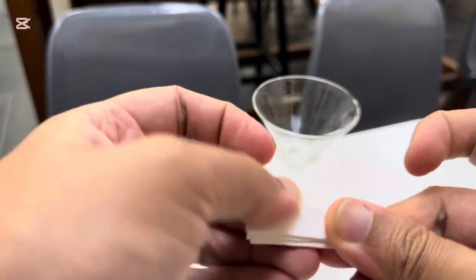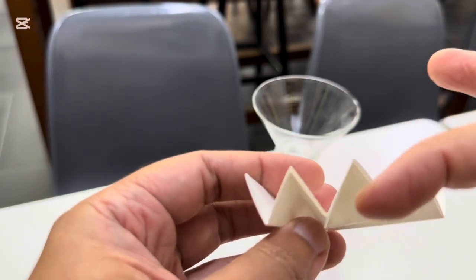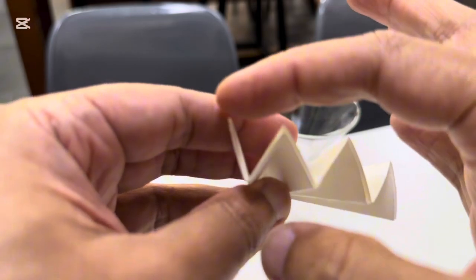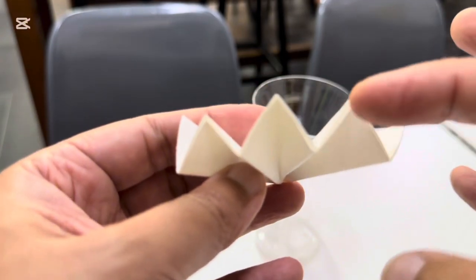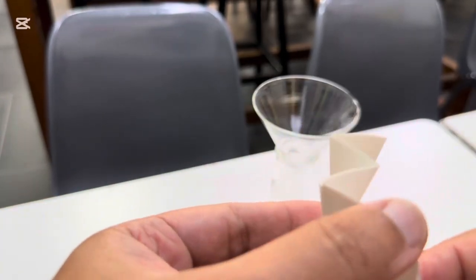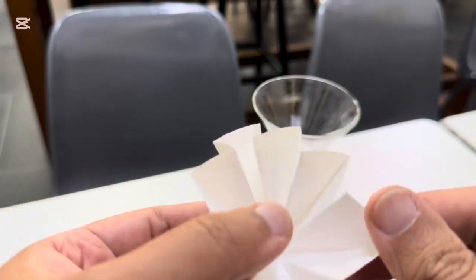If you look at it on the side, you will then see this concertina pattern coming through. It starts from this side, it goes down, up, down, up, down, up, down, and then up. What you now need to do is open this out.